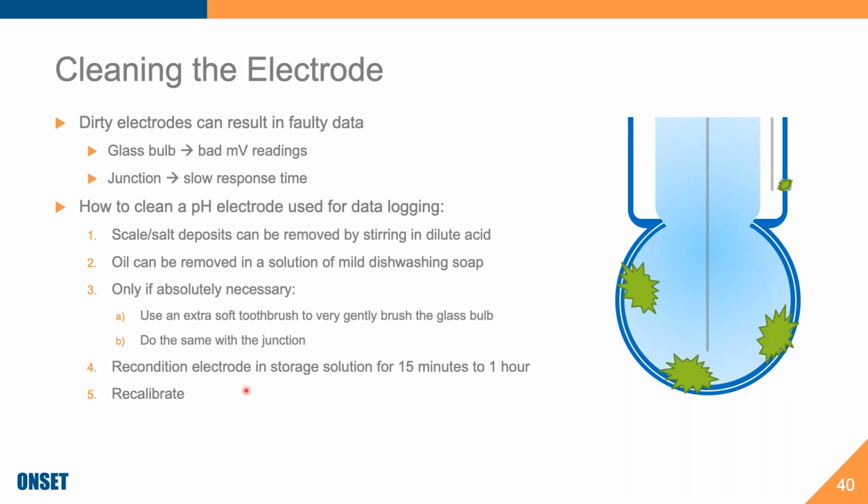So this is an important thing to consider when you are buying a pH logger or a multi-parameter sonde, and that is, how expensive are the replacement electrodes? They are meant to be consumables in my eyes, so they shouldn't be too expensive, but for a general purpose pH electrode, having an extra on hand is always a good idea. Having 2 extras in case one gets cracked is an even better idea. And that's more about the high maintenance nature of pH electrodes.